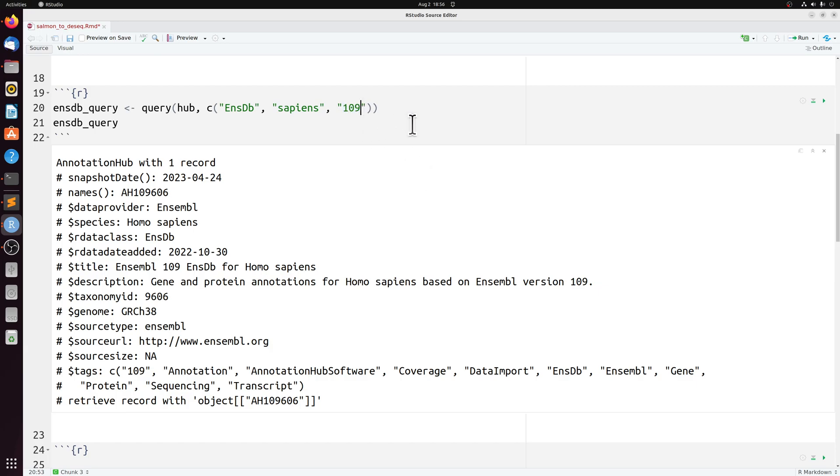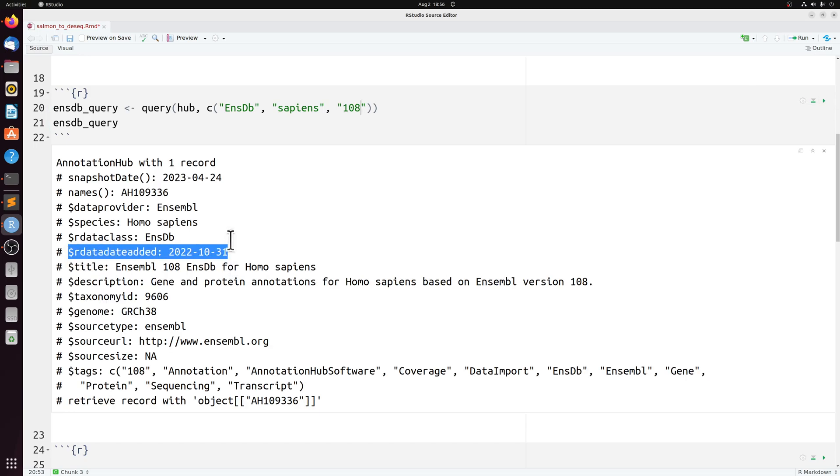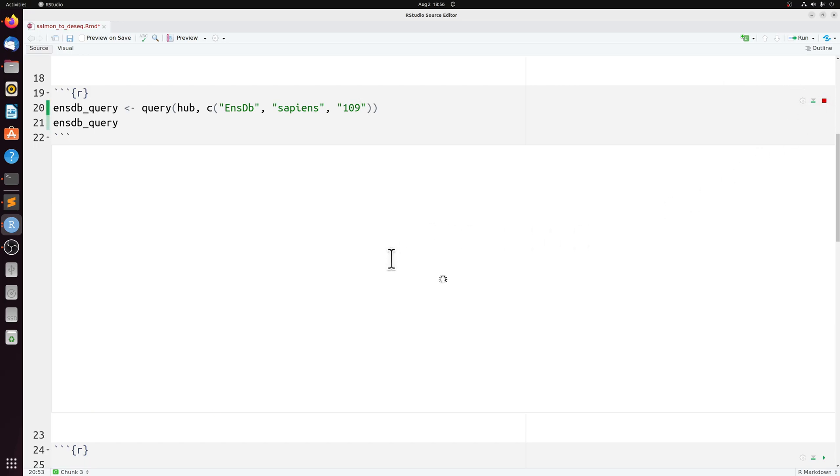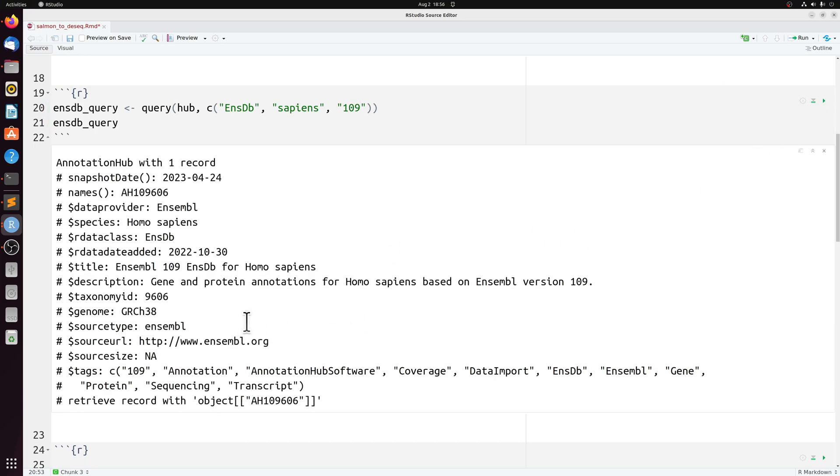But for example, you can just search other builds. For example, if I put 108 here, it'll come up with the earlier 108 build. But 109 is currently the most recent one available here.